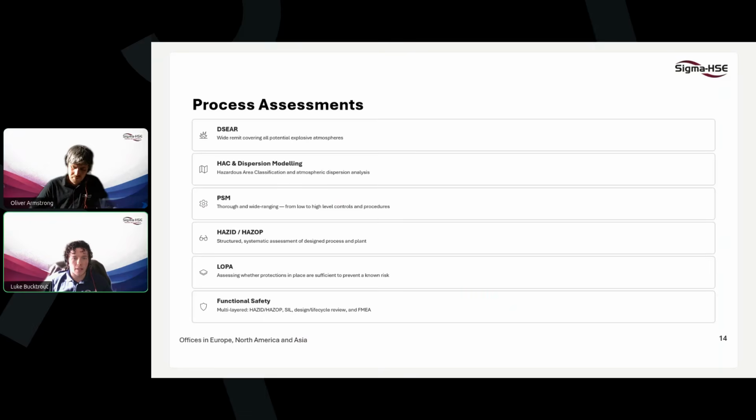We have hazard and dispersion modeling, which can be used to assess the risk to a specific failure mode from a vessel failure due to runaway reactions or venting mitigations. While we have more structured methodology in the form of hazard studies and HAZOPs to identify and score failure modes of a system, all of which often call for testing data to fill gaps in the understanding, to which, as we've covered in this presentation, DSC can be a really cost-effective and versatile solution.